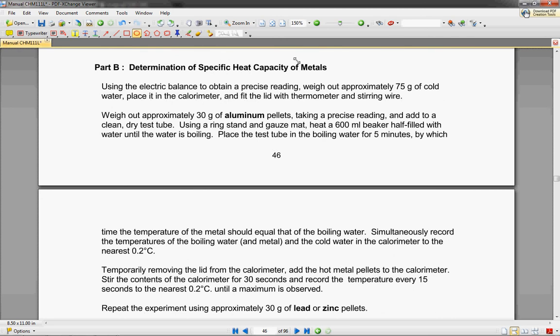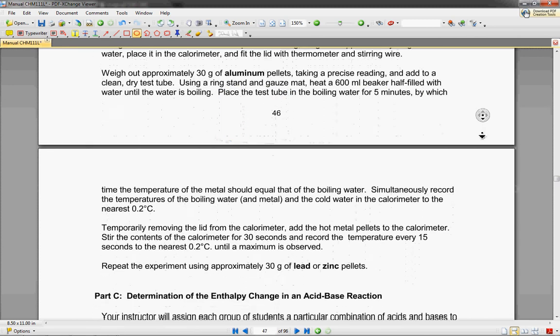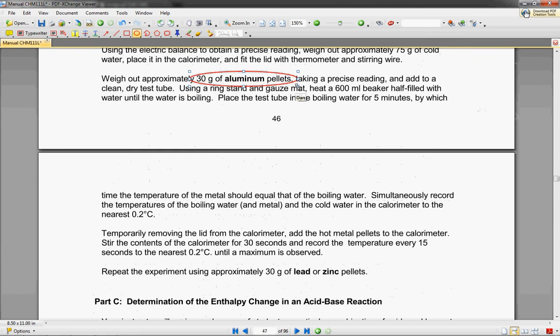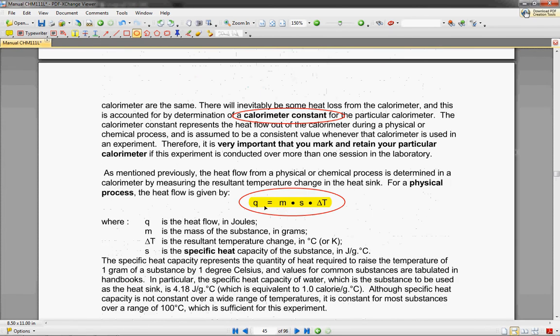So after that, we're going to determine how much heat metals hold. So this time, we're going to put apart 75 grams of cold water and put it in the calorimeter. And then we're going to weigh out 30 grams of aluminum. And we're going to heat that aluminum up by placing it in a test tube in boiling water for five minutes. So what that will do is just essentially heat up the aluminum to a very high temperature, roughly that of boiling water. And that will help us then when we put in the aluminum pieces, the aluminum pellets into our cold water, you're going to observe a change in the cold water temperature. So obviously the temperature of the cold water will increase. How much it increases depends on the specific heat of those aluminum pellets.